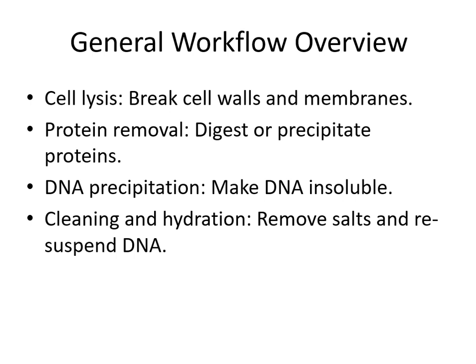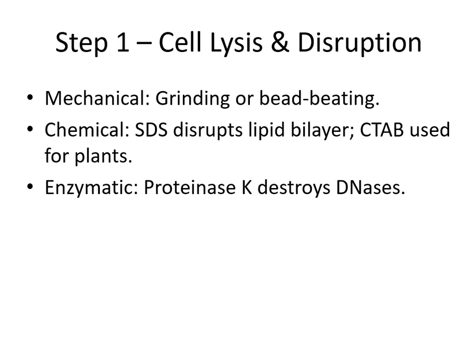Now, I would like to let you know in depth about cell lysis and destruction of the cell. For that, we can either use mechanical methods, in which we go with grinding with a mortar and pestle, or bead beating techniques, or a chemical method, in which we can use sodium dodecyl sulfate to disrupt the lipid bilayer, and we can also use the CTAB method for plant DNA extraction.